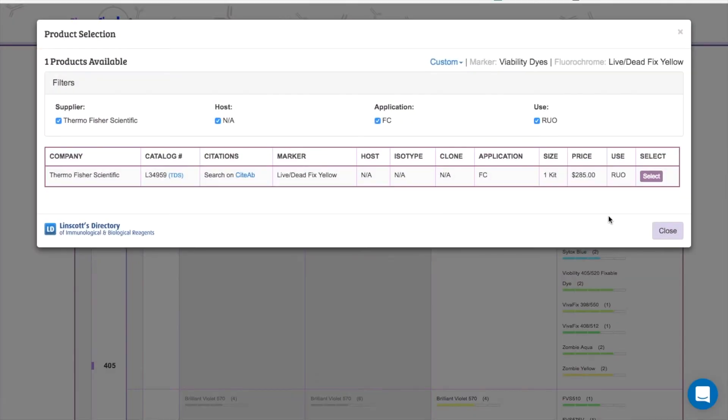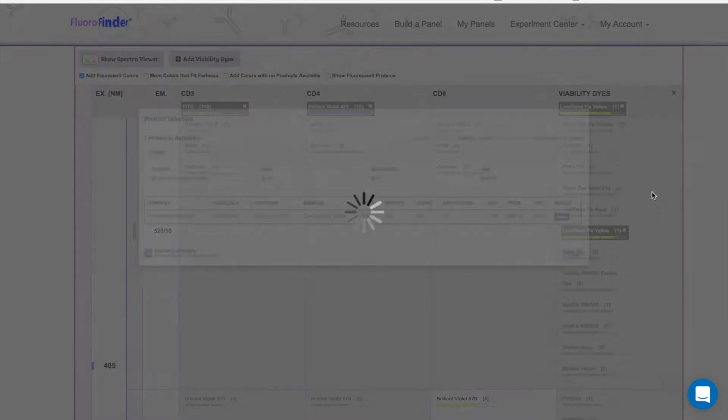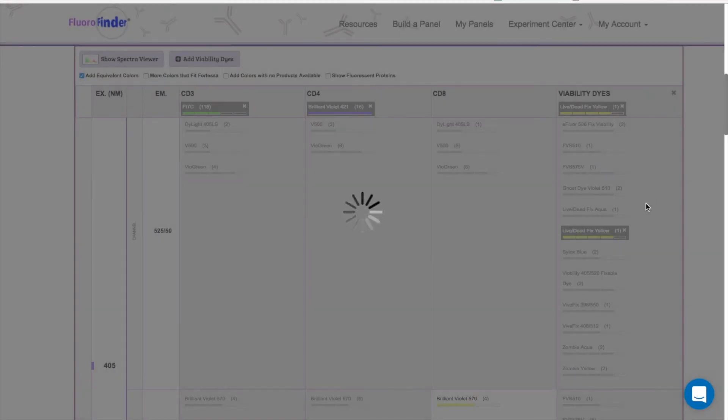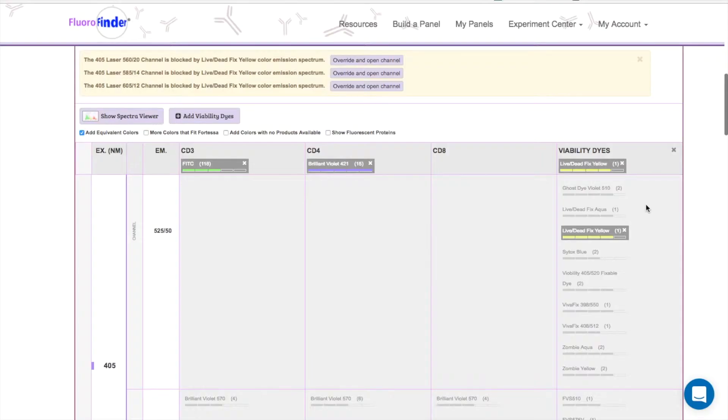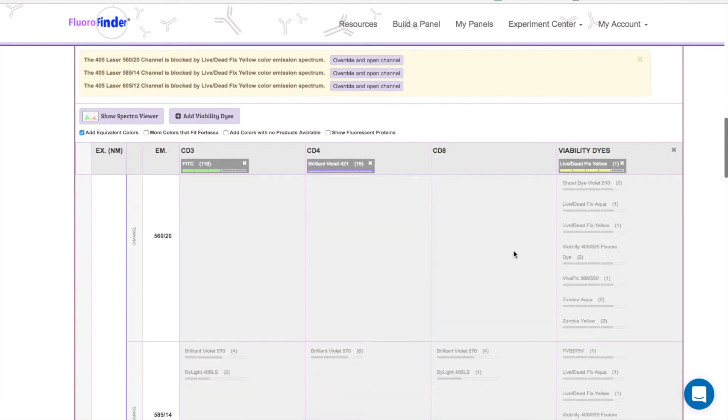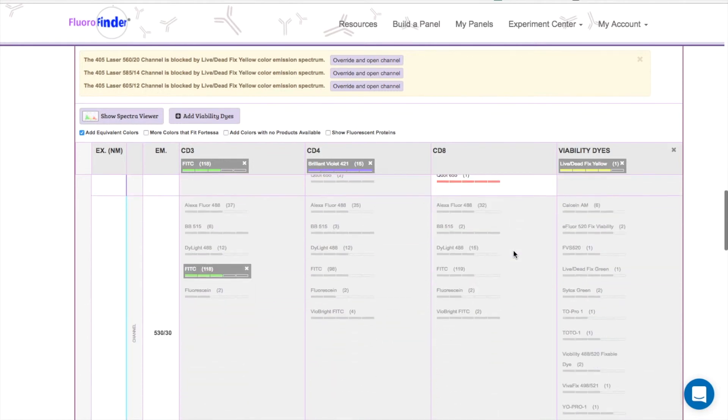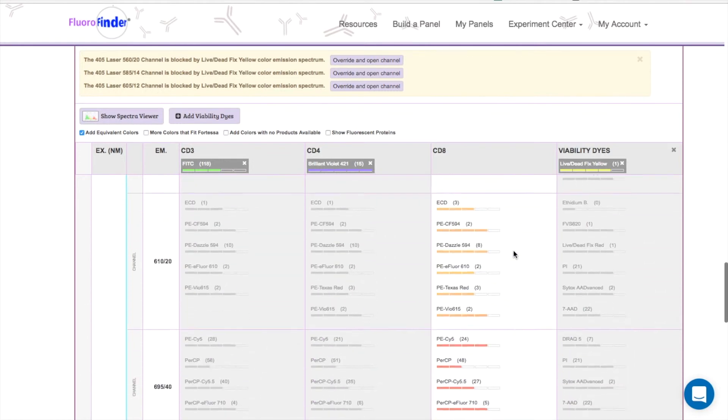Now you'll see another feature. Because this dye has a broad emission spectrum, it's actually being picked up by multiple detectors on this machine. These channels have also been blocked out, saving you the hassle of excessive compensation when you go to run your experiment.